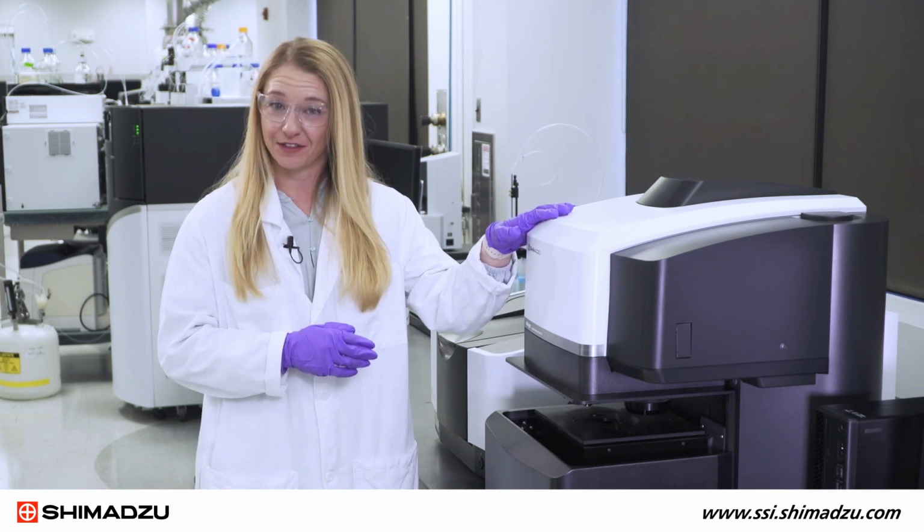In this video, I'll be showing some best practices when using your new Shimadzu AIRsight infrared Raman microscope. Before we turn anything on, let's discuss the important hardware components of the AIRsight and where they're located.